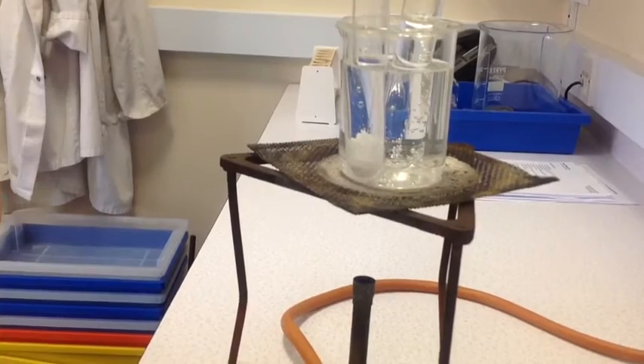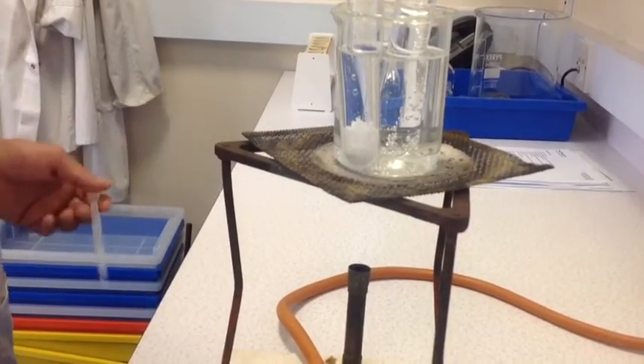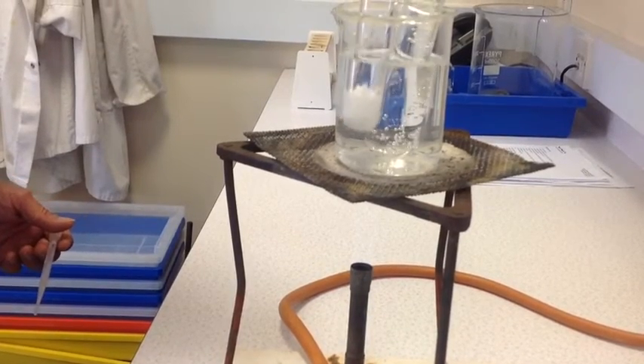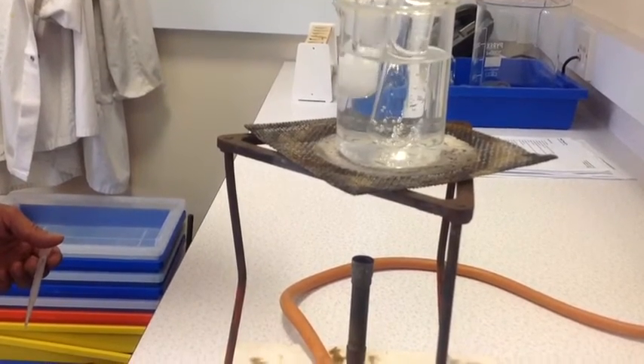I should add that if your water bath is boiling too vigorously you can move the Bunsen out so it doesn't overboil. I'll just hold the boiling tube, give it a little shake. I'm going to need more in there, I can see.